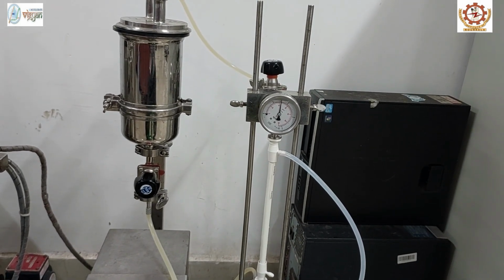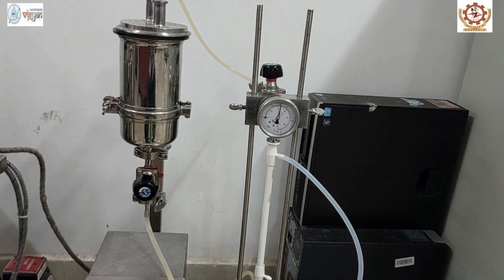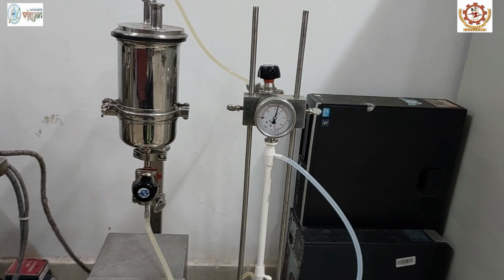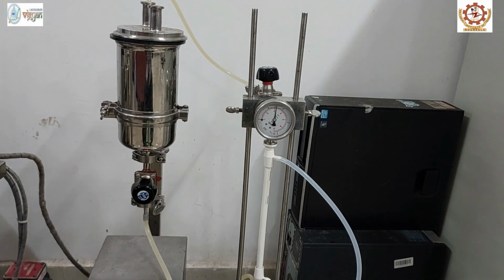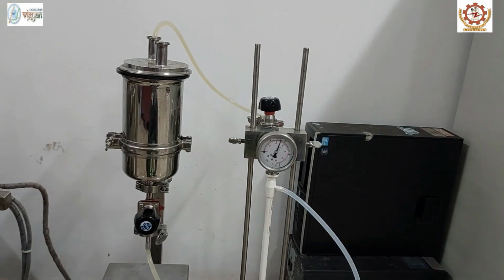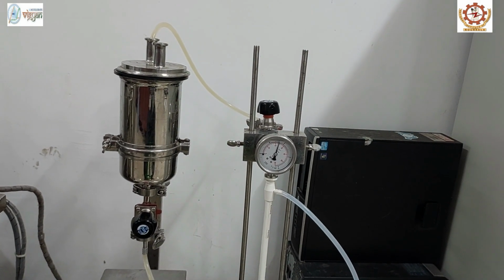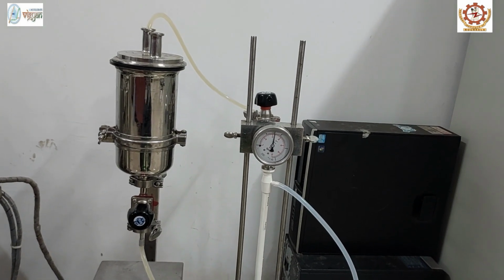In backward flushing, the feed water or permeate is flushed in the direction opposite to the actual flow at high pressure. The flux during backward flushing will be twice that of the flux during regular filtration.